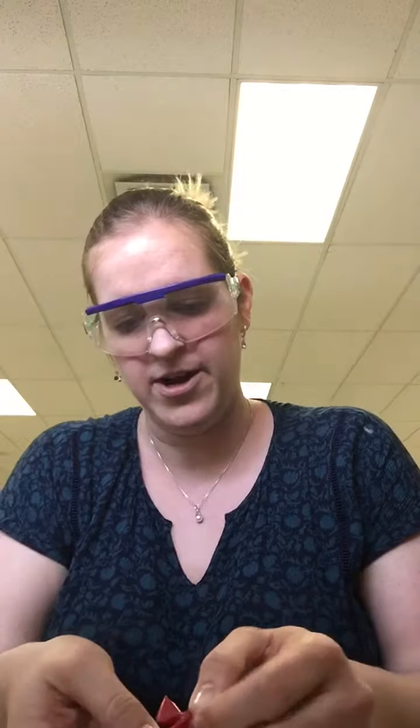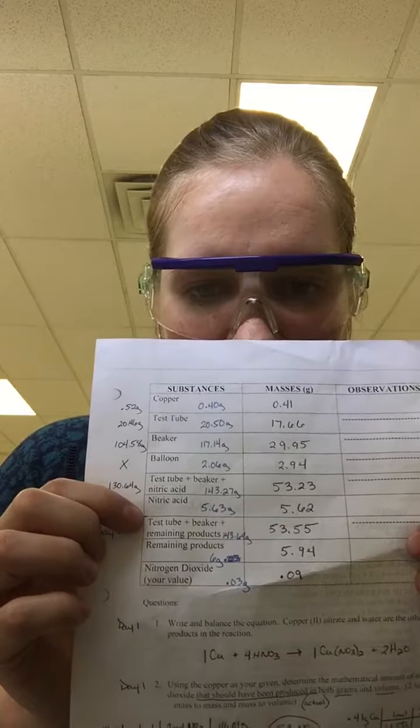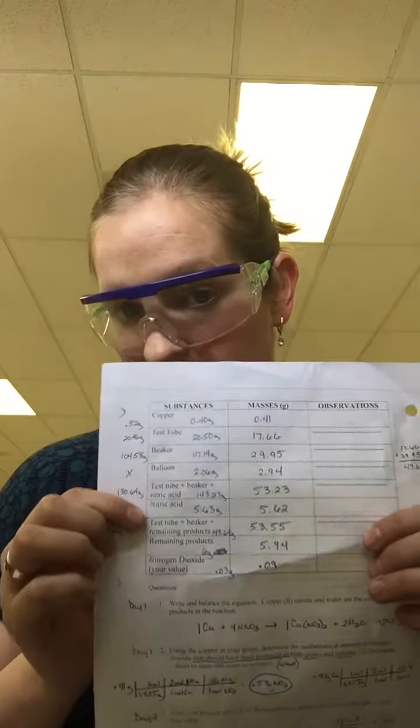Say this is mine going on right now. I don't have a balloon on mine, but let's just say this is one of your setups for tomorrow. Right here, where you start day 2, it says the test tube, the beaker, and the remaining product. You need to remove the balloon if you have one, so make sure you remove it.